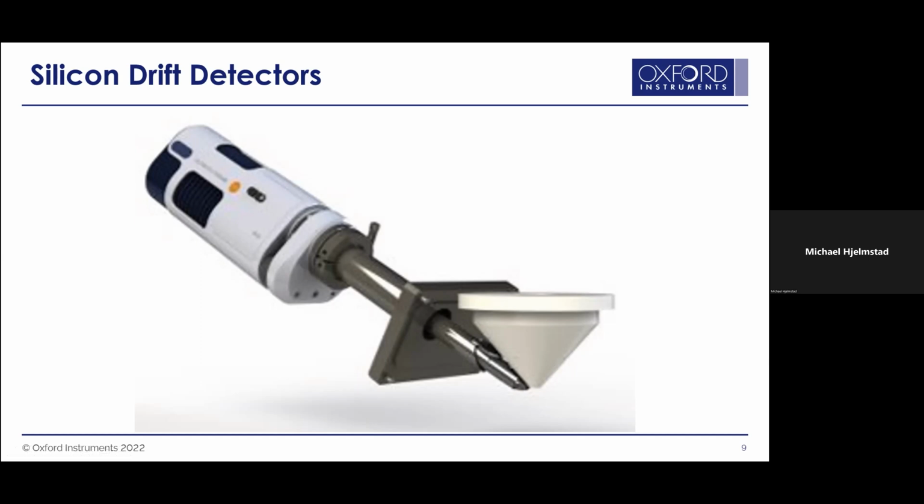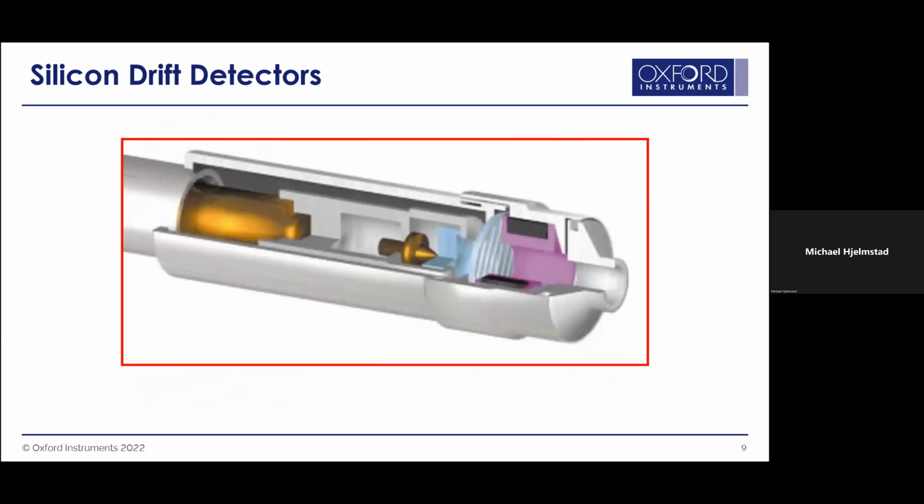We'll retract it otherwise. So it gives you a good spatial representation of it. But what does it look like at the front end? Because all that matters is right at the nose of the system. I don't want to dive into all the parts necessarily, but there are really five components here.